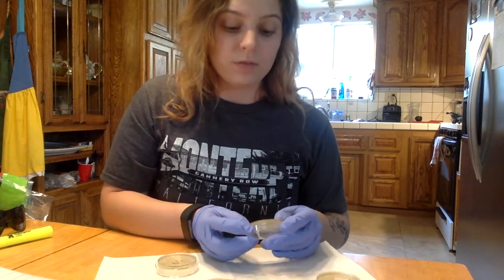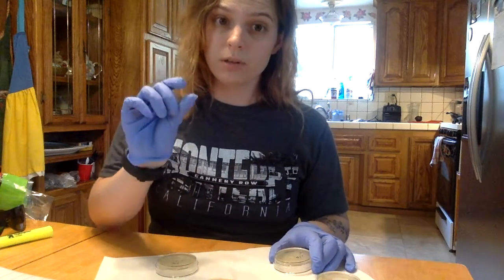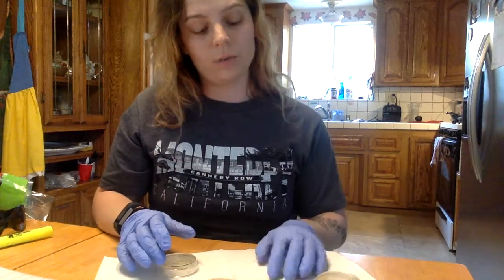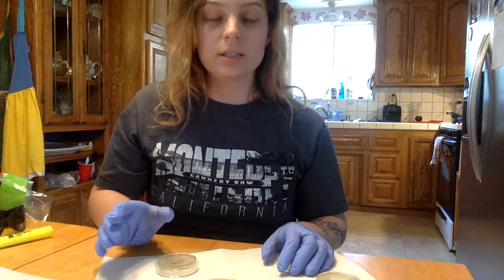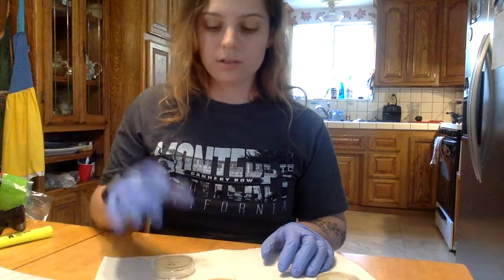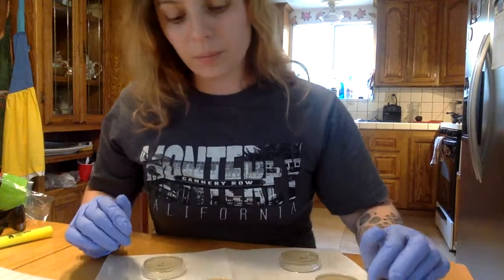The most I had was 15 because they either clumped into big groups or they're very little tiny dots. So the original number was 15. The least I had was 6, and that was because there was just big groups of the colonies.